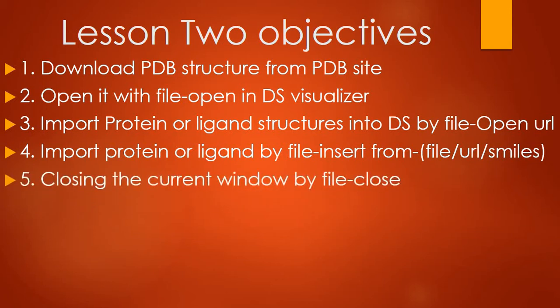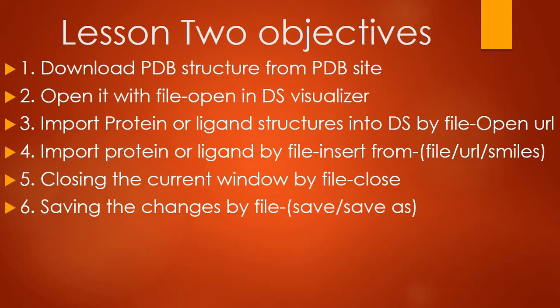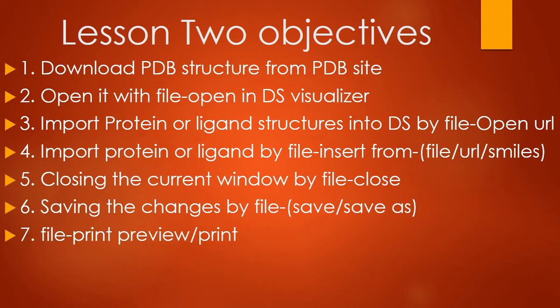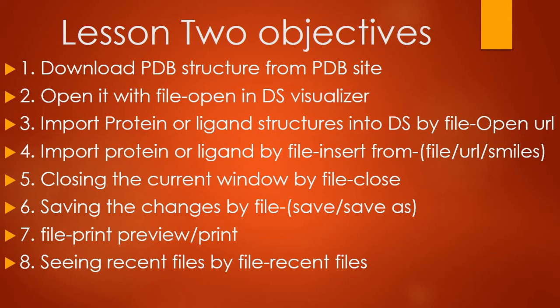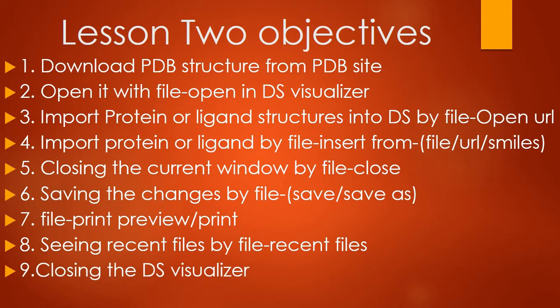Then we will learn how to close the currently opened window by going to File menu and selecting the Close option. Our sixth objective is saving the changes you made in your structure by going to File and clicking on the Save or Save As option. Our seventh objective is going to File menu and seeing the print preview or printing the image of the current window. Our eighth objective is to see the recently opened files by going to File and selecting the Recent File option.